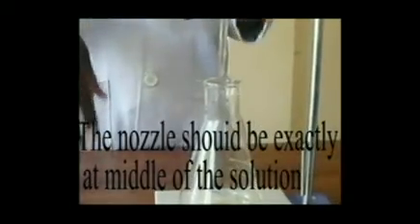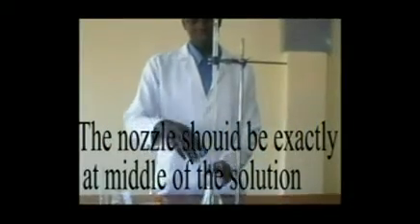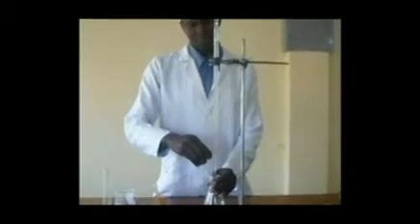The color changed from colorless to yellow. Then start to titrate. First, place the conical flask under the burette, whereby the nozzle of the burette should be exactly at the middle of the conical flask. Start to titrate slowly.